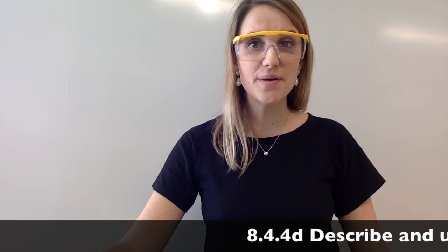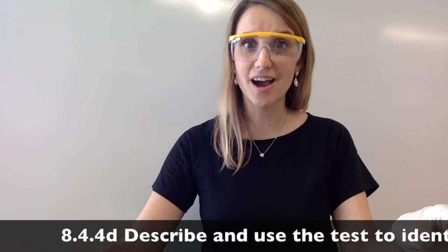Hi guys, so this video is about how you test for hydrogen gas.